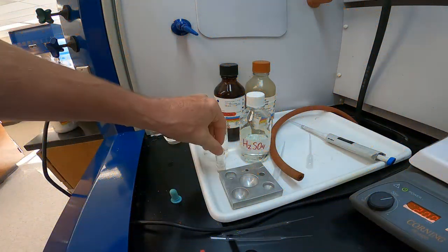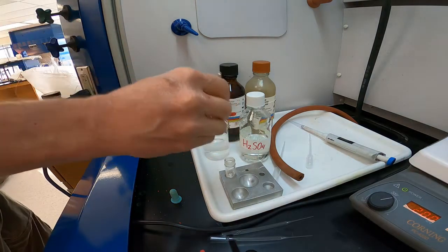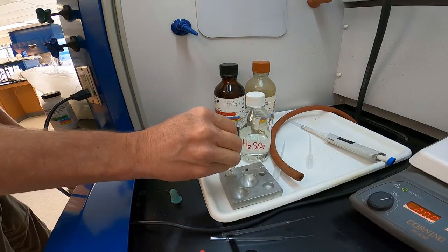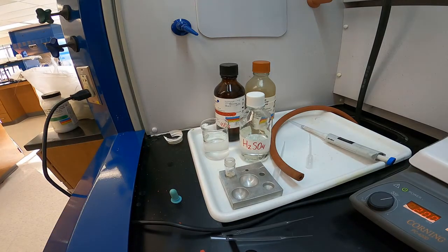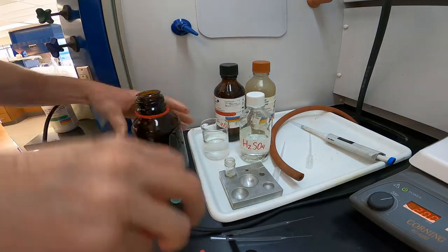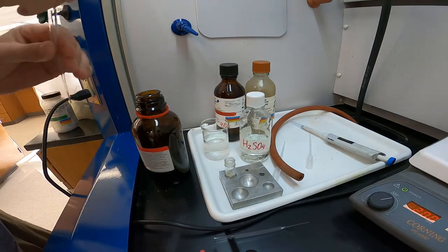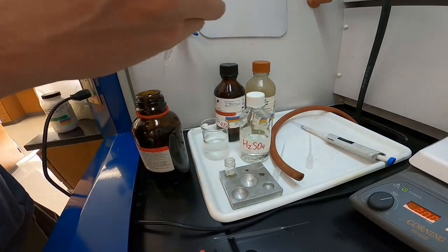All right, so I have the vial removed from the hot plate. I've let it cool a little bit. Then the next step would be to take out the little magnet with tweezers. And those are pretty expensive, so be careful not to lose them. We'll wash everything in a little bit. So next I'm going to add about a milliliter of ether, and I'm just going to use the graduations on the vial. A little excess is fine.